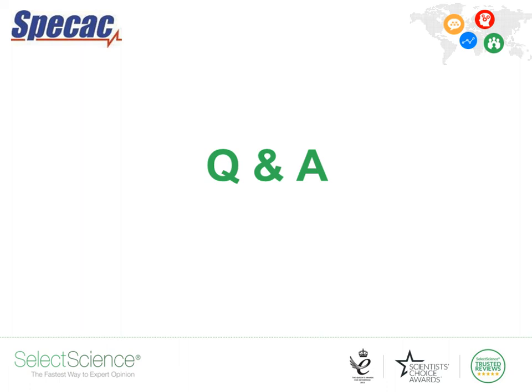When would you use fusion beads versus pellets? Oh, this is a very interesting question. Generally speaking, as I said in the webinar, you want your sample to be as homogeneous as you can get it, and you want the sample surface to be as smooth as possible. And pressed pellets are a great way of doing that for a very, very wide range of samples. You can use it on almost anything, whether it's plant matter, soil, something like titanium oxide used in the pharmaceutical and cosmetic industries, cement, iron tailings, all of those sorts of samples.